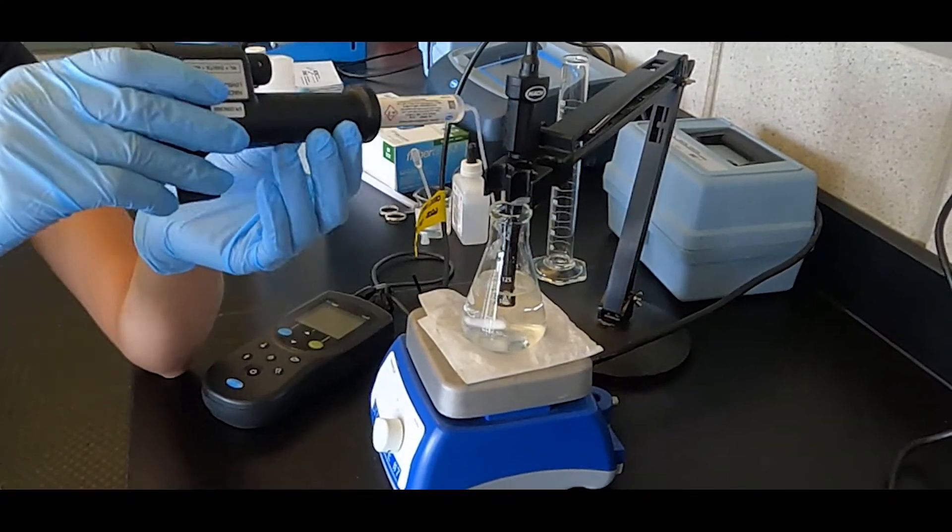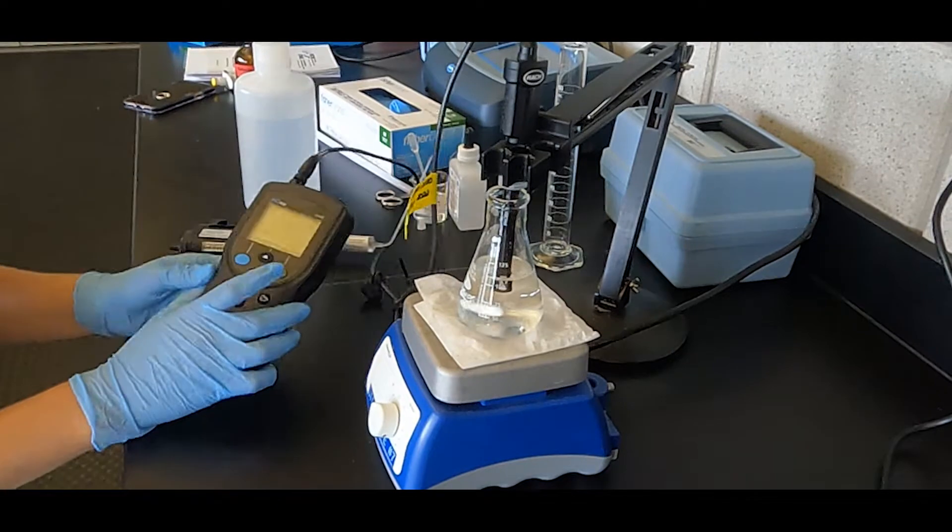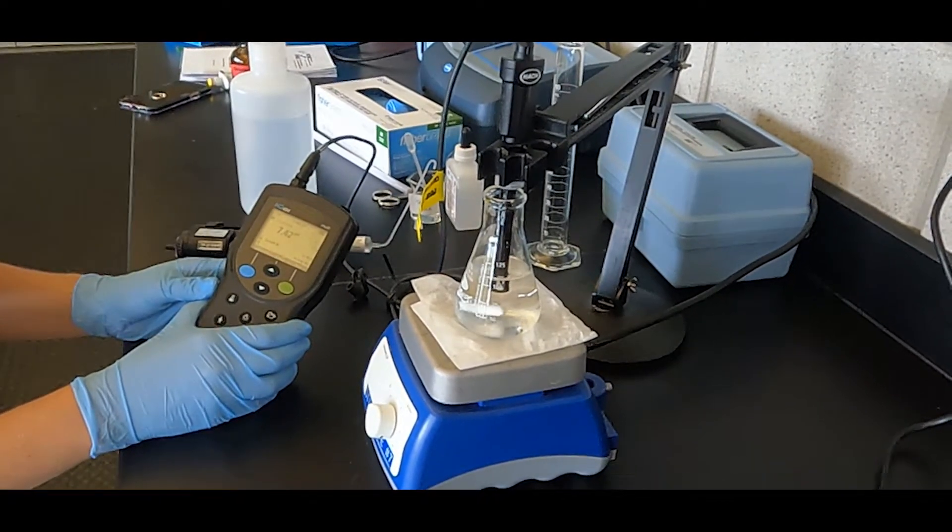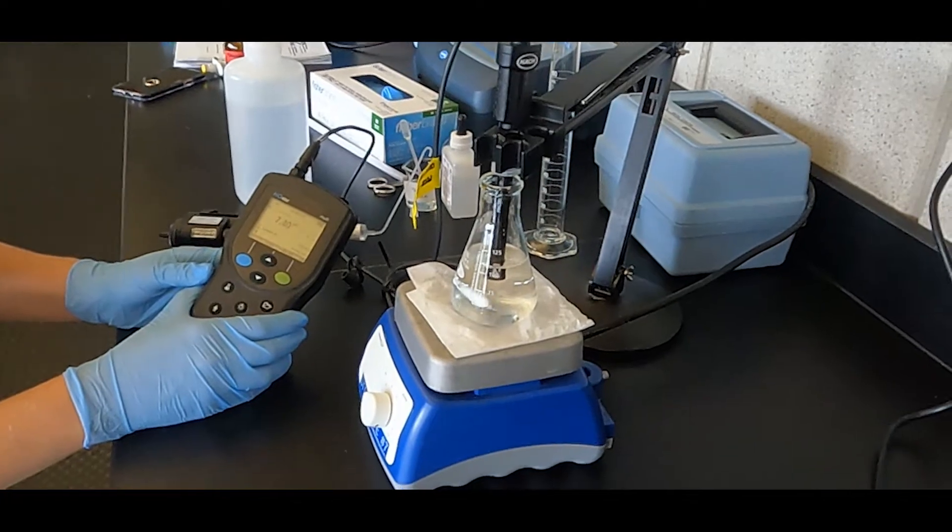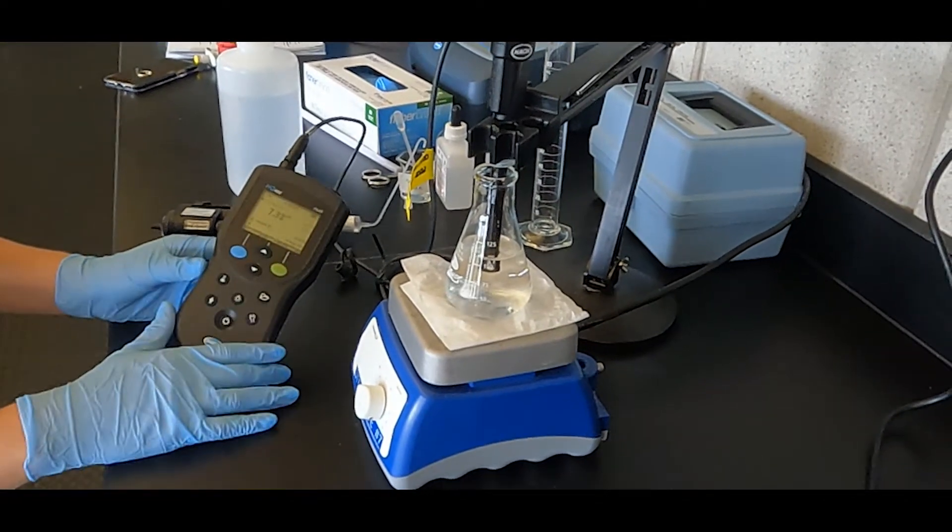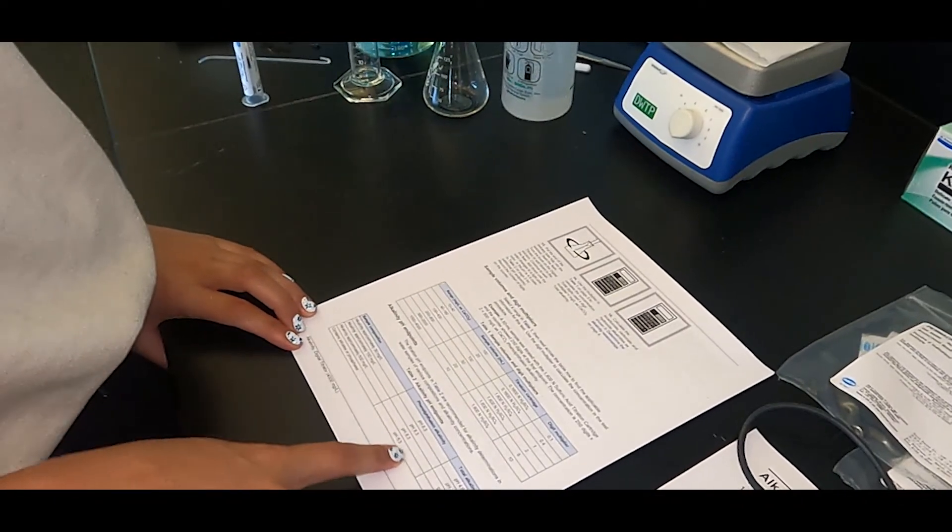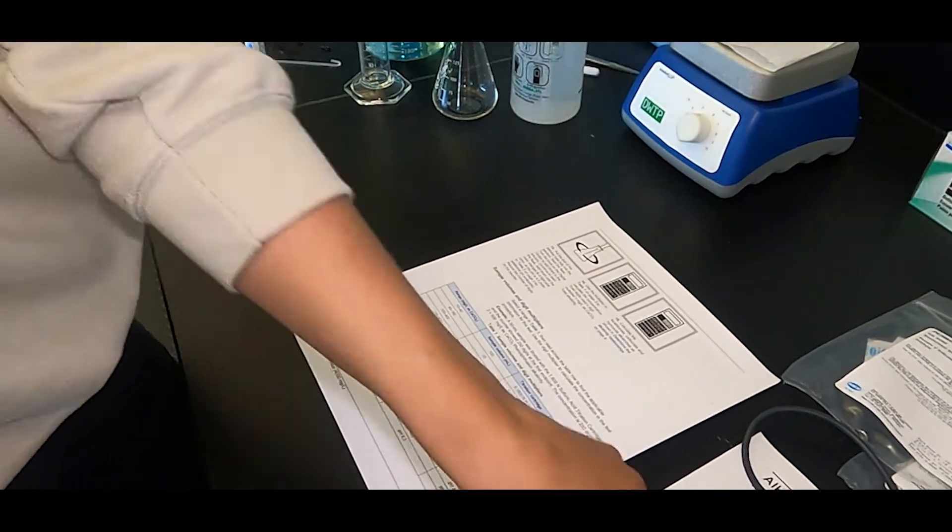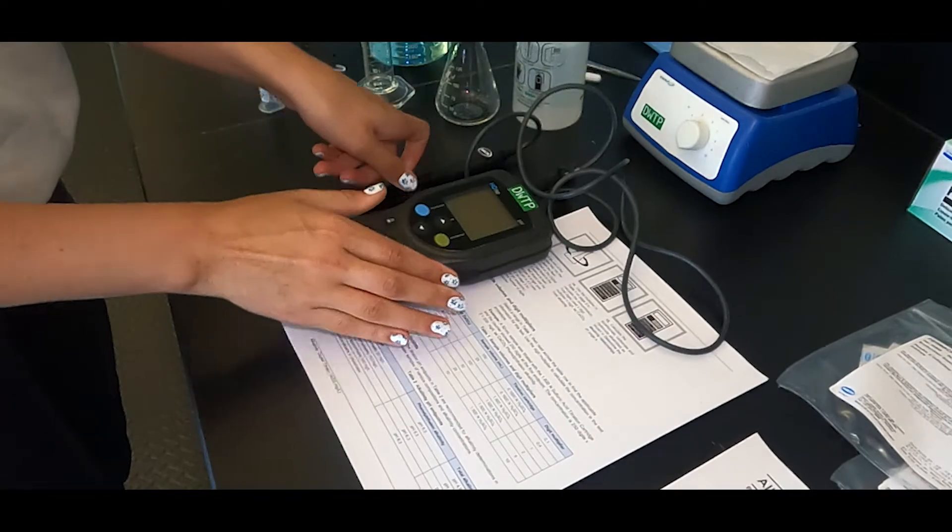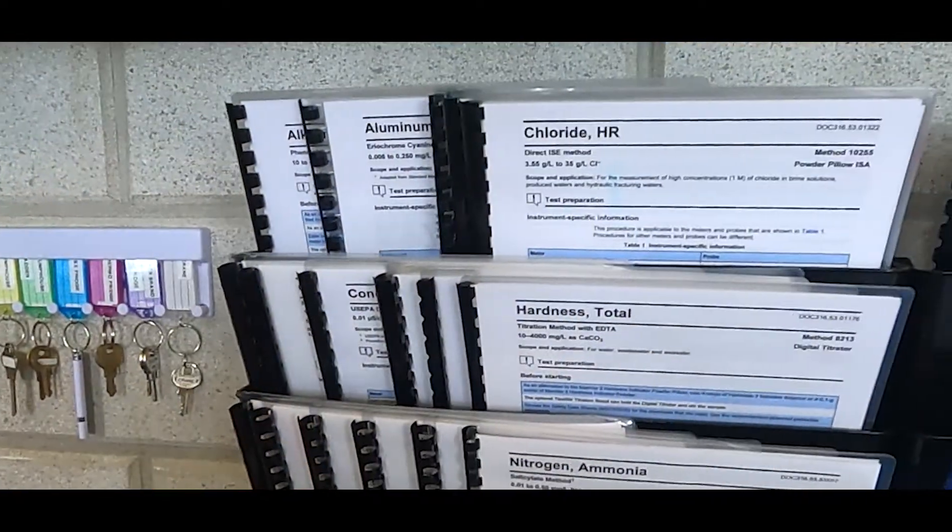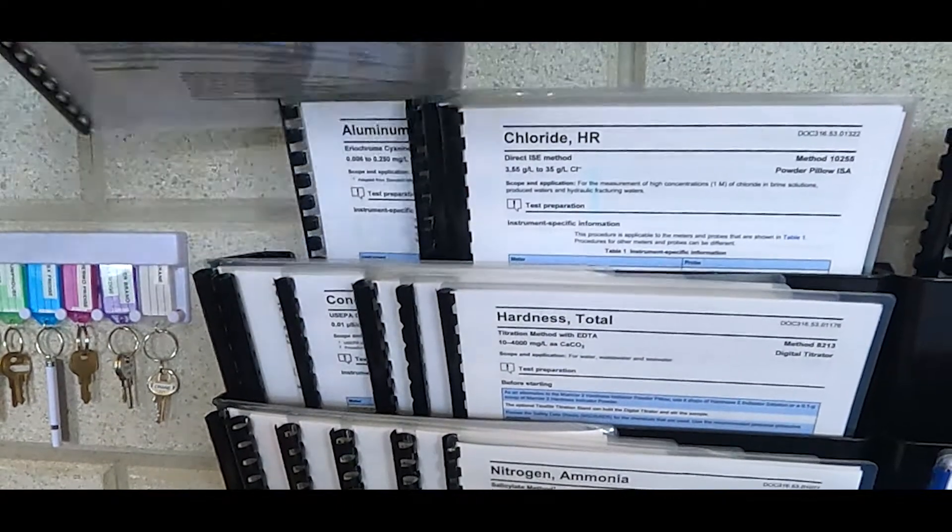Color indicators can be omitted if a pH meter is used to determine the endpoints. This may be helpful if your sample is colored or turbid or if the operator has color blindness. A table is provided in the method to specify pH endpoints for phenolphthalein and total alkalinity based on the type of sample that is being analyzed. Refer to your method for more details.